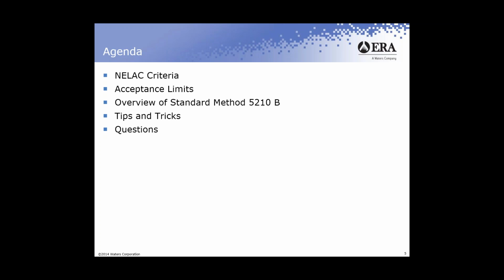And I want to let you know, as with my past tips and tricks webinars, it's not designed to introduce you to how to run the BOD tests because you already know how to do that. But really we'll focus on education, specifically education of the PT criteria and of the method itself and how to avoid some of our pitfalls.